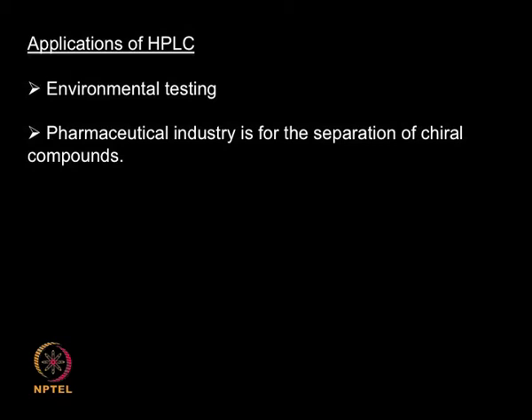It can be used in the pharmaceutical industry for separation of chiral molecules. It can be used in pharmaceutical industries for identifying impurities present. So HPLC, that is the high performance liquid chromatography or high pressure liquid chromatography, has quite a lot of applications.